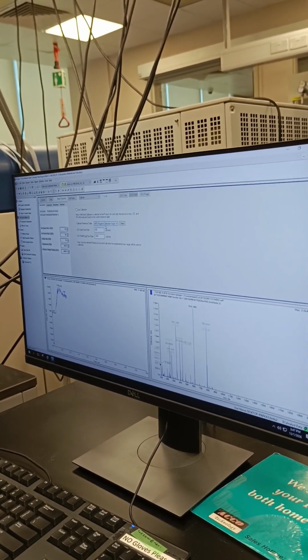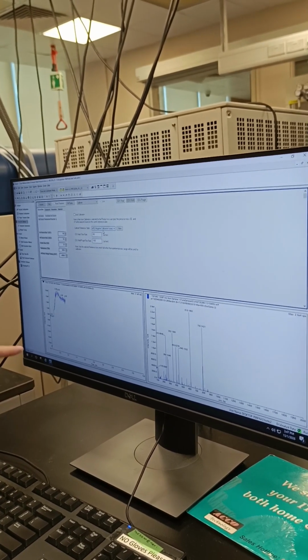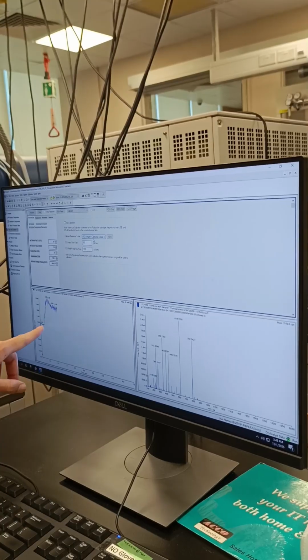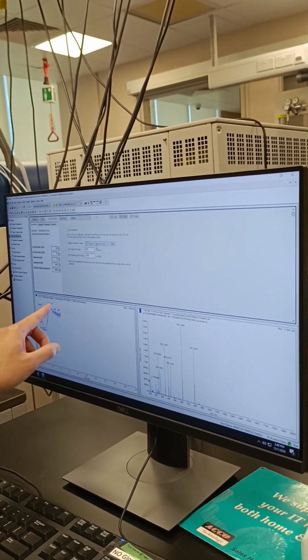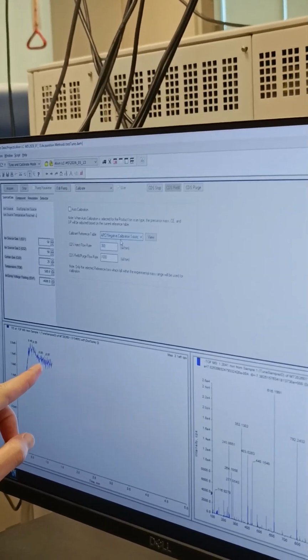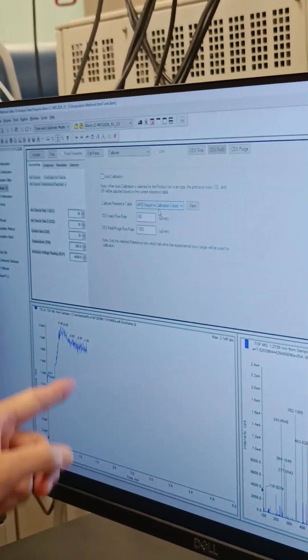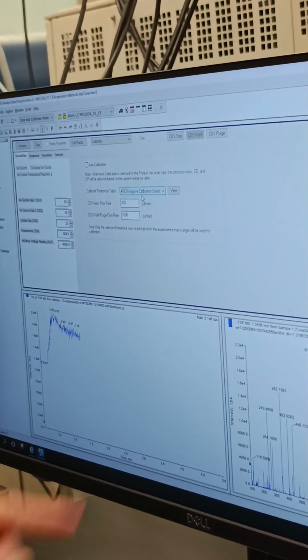Usually for this first step, the calibration, you just have to wait for at least 1 minute, as long as it's stable. So I won't take this range because it's not stable. You see there's this spike up, then it goes down a little bit. Then I'll probably start taking the range from like 0.7 here, or maybe if you want a bit further up, 1 to 2.